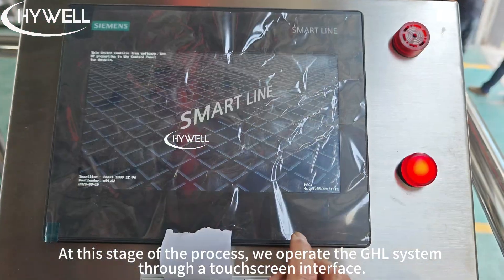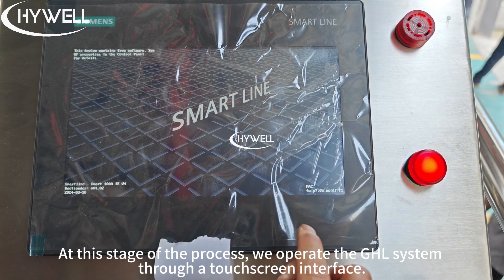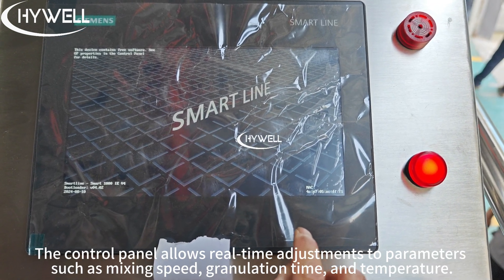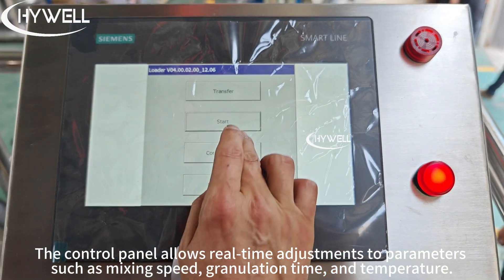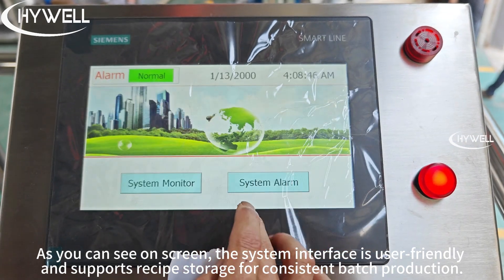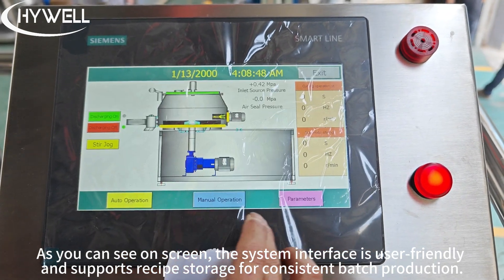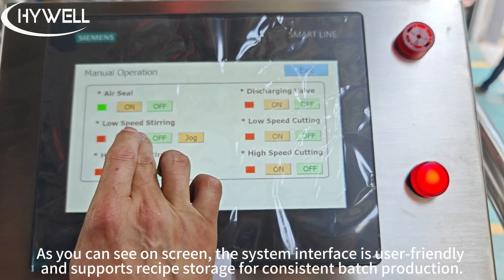At this stage of the process, we operate the GHL system through a touchscreen interface. The control panel allows real-time adjustments to parameters such as mixing speed, granulation time, and temperature. As you can see on screen, the system interface is user-friendly and supports recipe storage for consistent batch production.